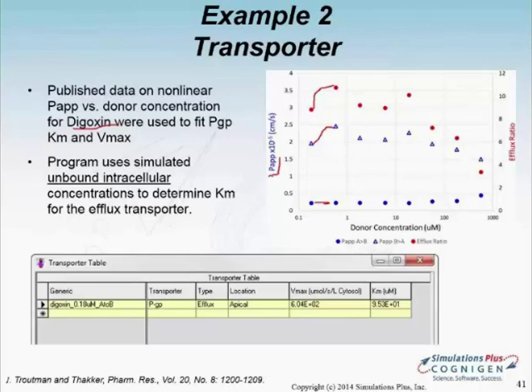Thank you, Viera. Another question is, does MembranePlus also account for membrane metabolism on the apical side as a concentration loss process? You mean metabolism inside of the membranes? We are definitely able to account for metabolism inside the cell. So we are using the intracellular concentration inside the cells to account for the metabolism. I'm not sure if that answers the question.